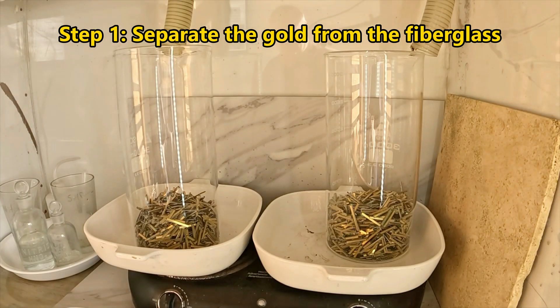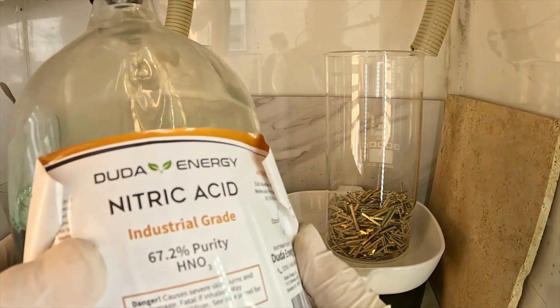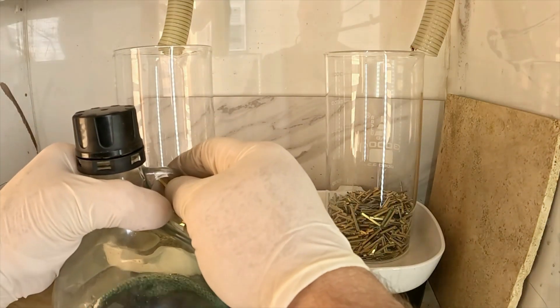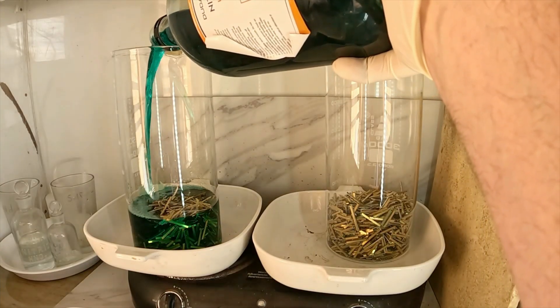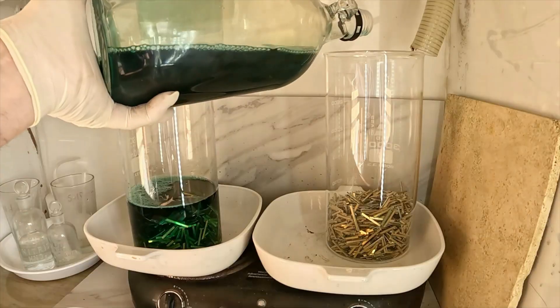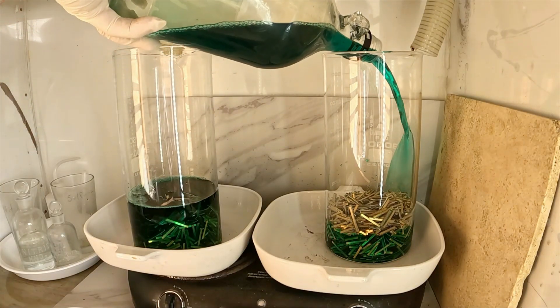Start by separating the gold foils from the circuit boards. The trick for speed: dissolve the base metals underneath using dilute nitric acid. I've split the batch into two beakers, 500 grams each. I'm starting by adding this already used but not exhausted nitric acid into each beaker. I'll put it on the heat and let that reaction run its course.